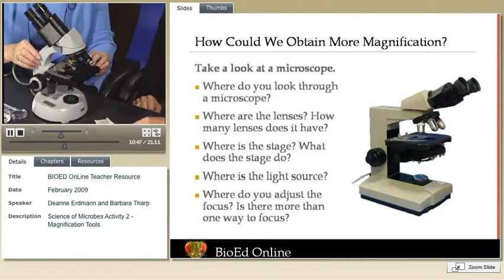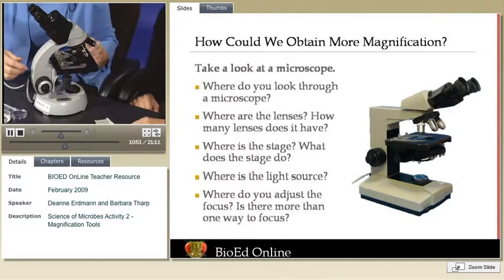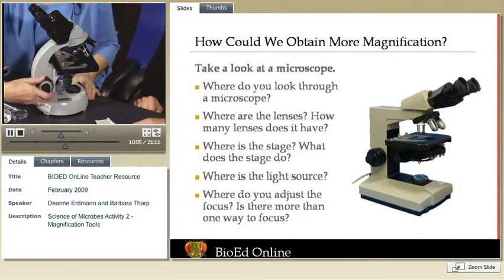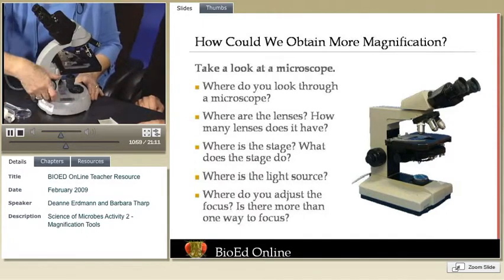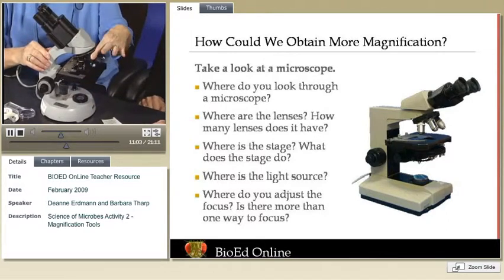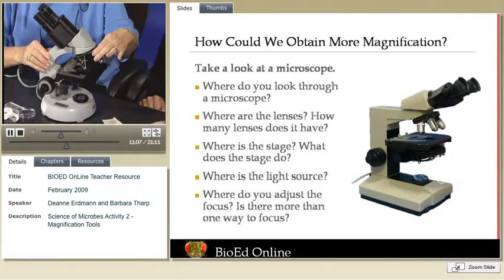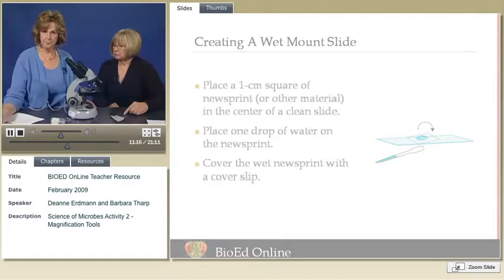And then a coarse adjustment knob, which moves the stage the most. Would you guess it to be the big or the small knob? I think it'd be the big one. The big knob. Yeah, and so obviously that moves the stage up and down closer to the object. Then we have the eyepiece, and this is called a rotating nose piece, and each one of these is an objective. There's a light source that comes in through the base that's going to illuminate our object. It comes right through a hole that's in the center of the stage.